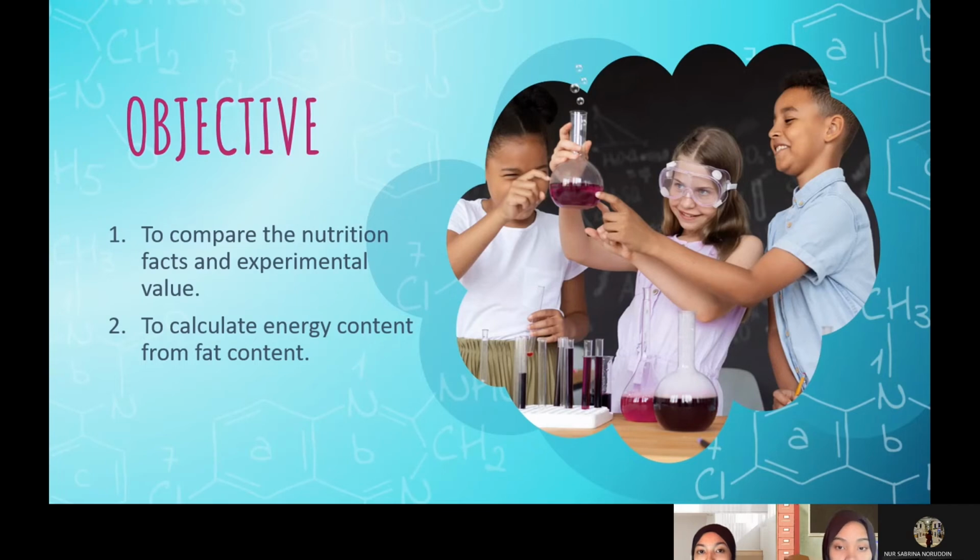Next is the objective of our project. The first is to compare the nutrition label fat and the experimental value. And the second objective is to calculate the energy content from the fat content.